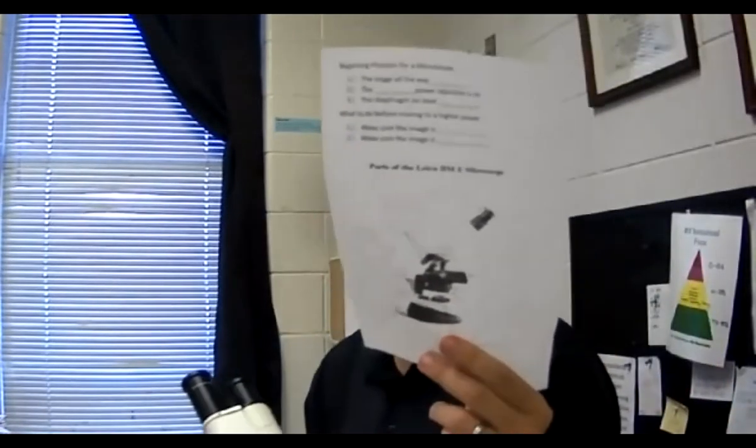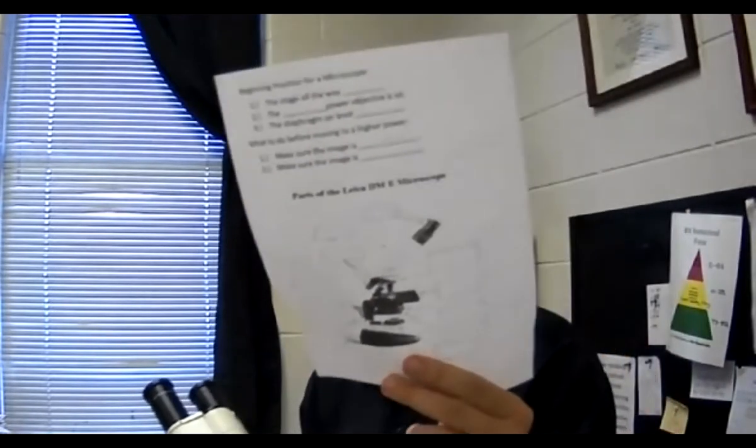What we're doing here today is going over the parts of a microscope. I have a microscope right here, and you're going to be filling out the sheet I gave you on Wednesday. If you don't have it, you can draw it out on paper, or you can print it out — whatever you'd like to do.